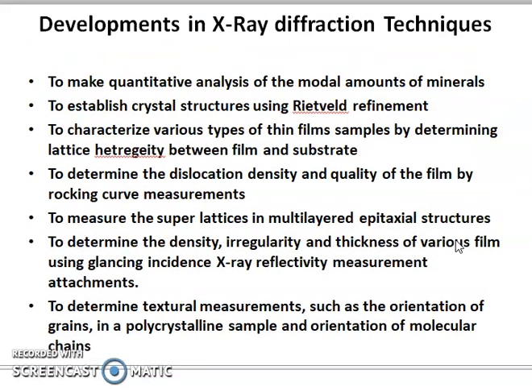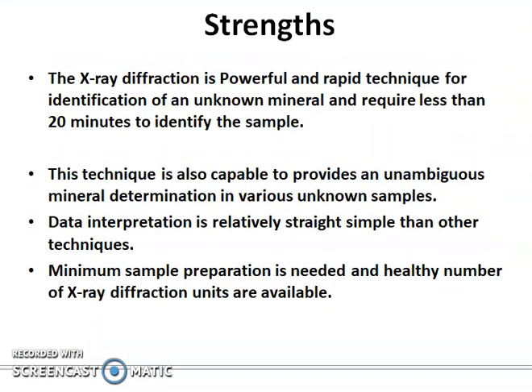This is a development of the X-ray diffraction technique to make quantitative analysis of modal amounts of minerals, to establish crystal structure using Rietveld refinement, and to characterize various types of thin film samples by determining the lattice heterogeneity between film and substrate, and to determine dislocation density, quality of film, rocking curve measurement, and so on. These are the strengths of this technique.